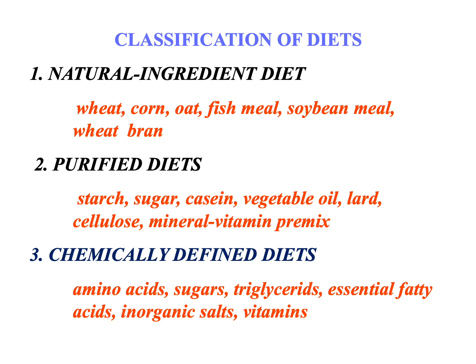But every time you have to add which starch, this is from potato or corn, which sugar, sugar cane or sugar from sugar beet pulp, which casein, which animal milk was used, from cow or from goat, which vegetable oil.